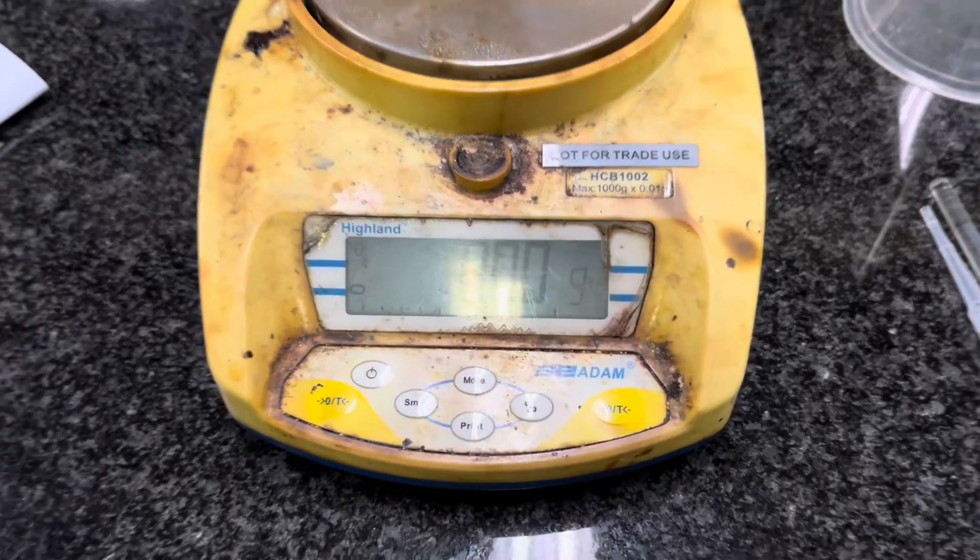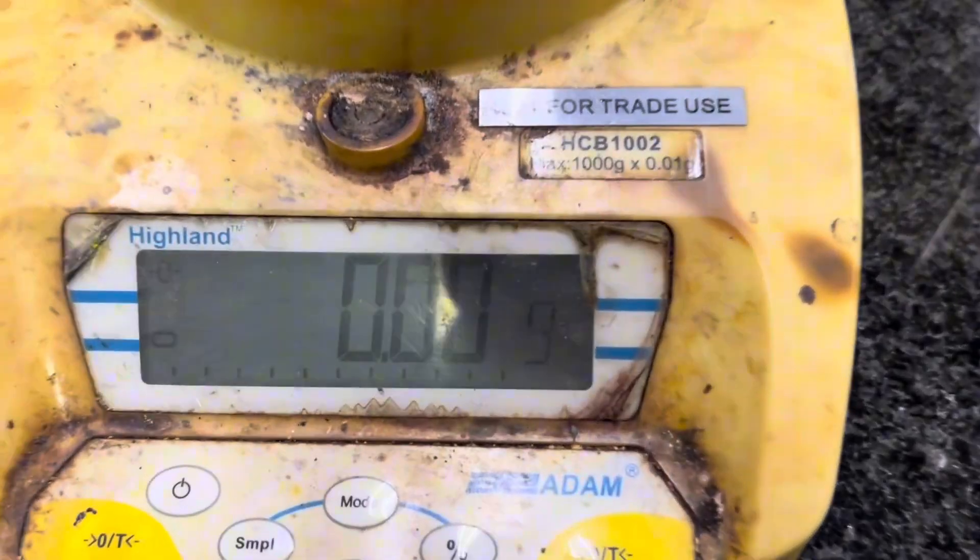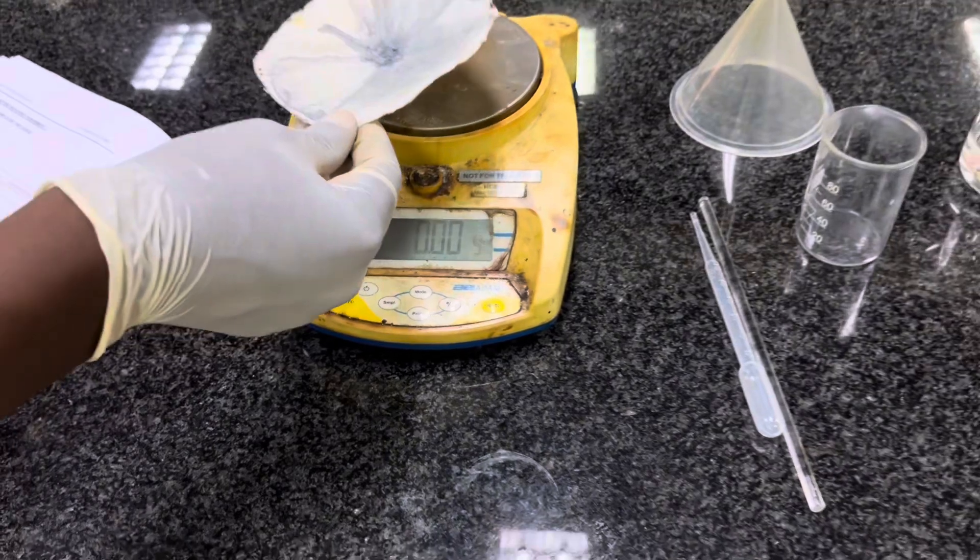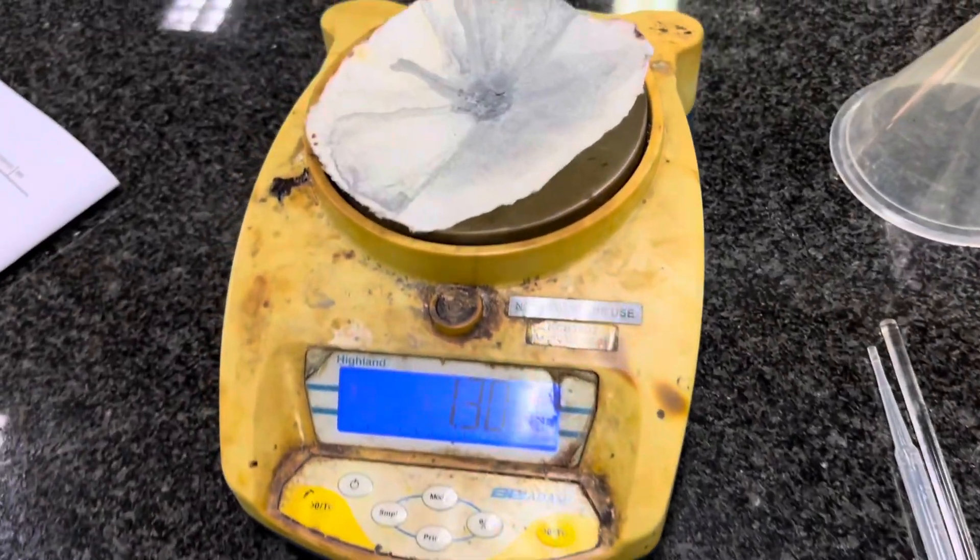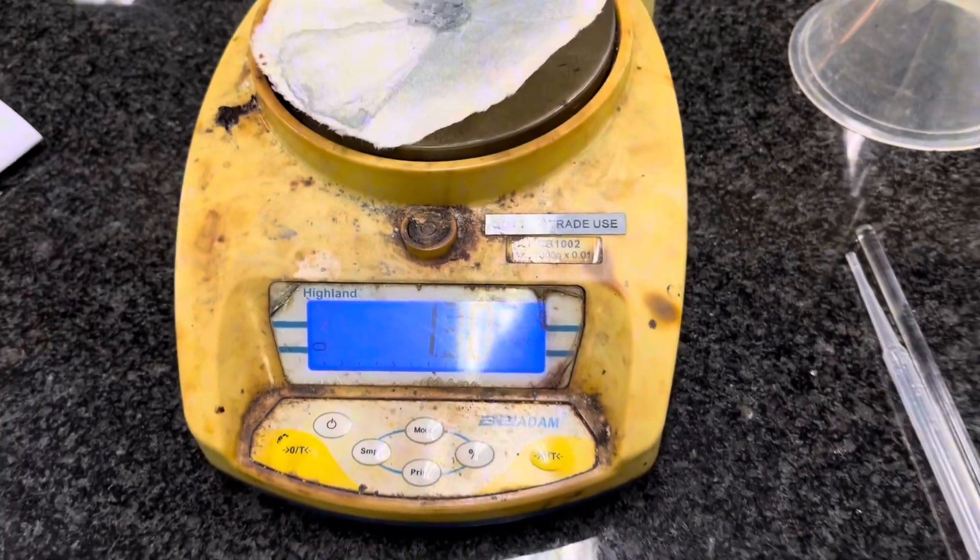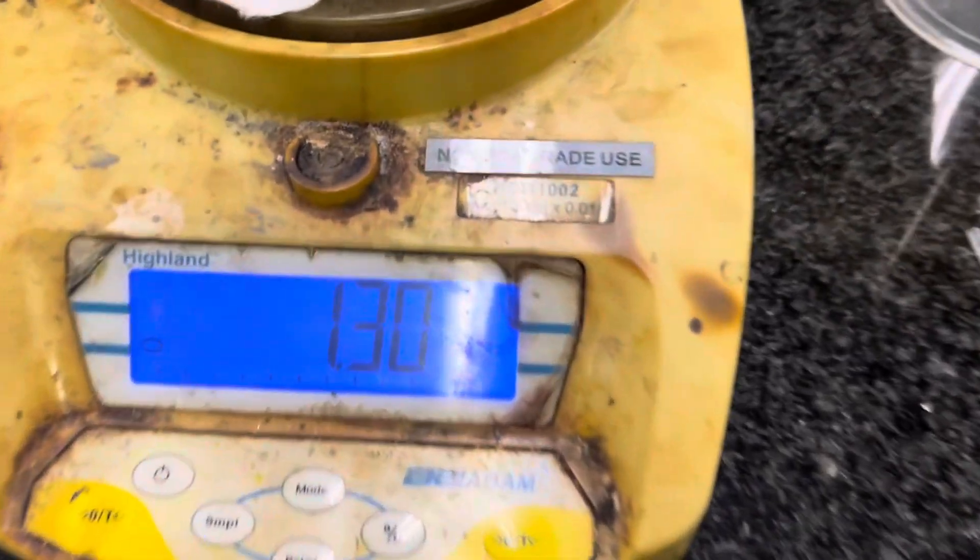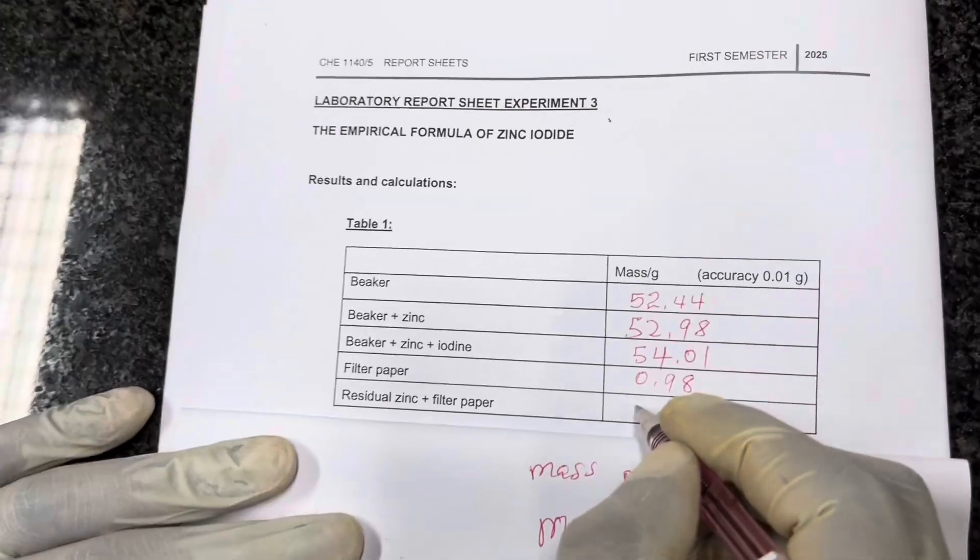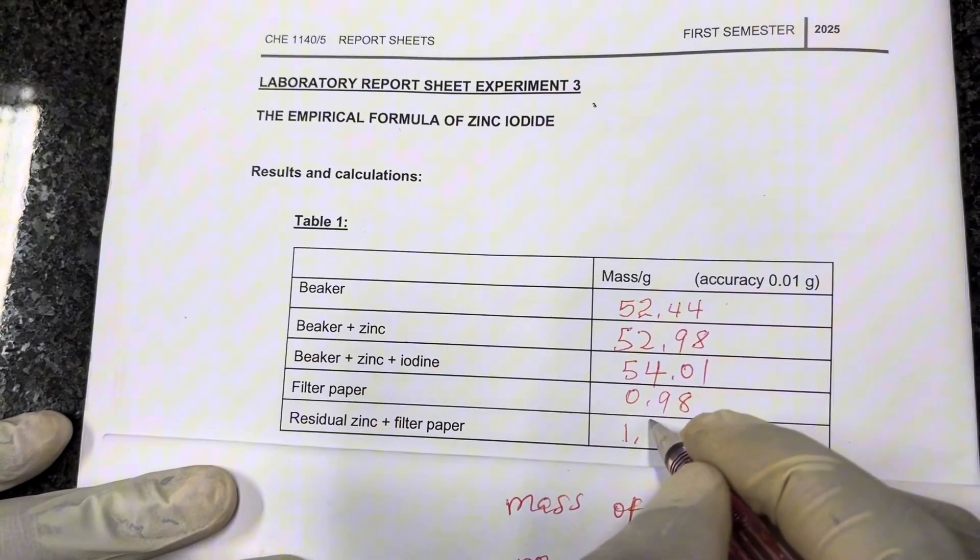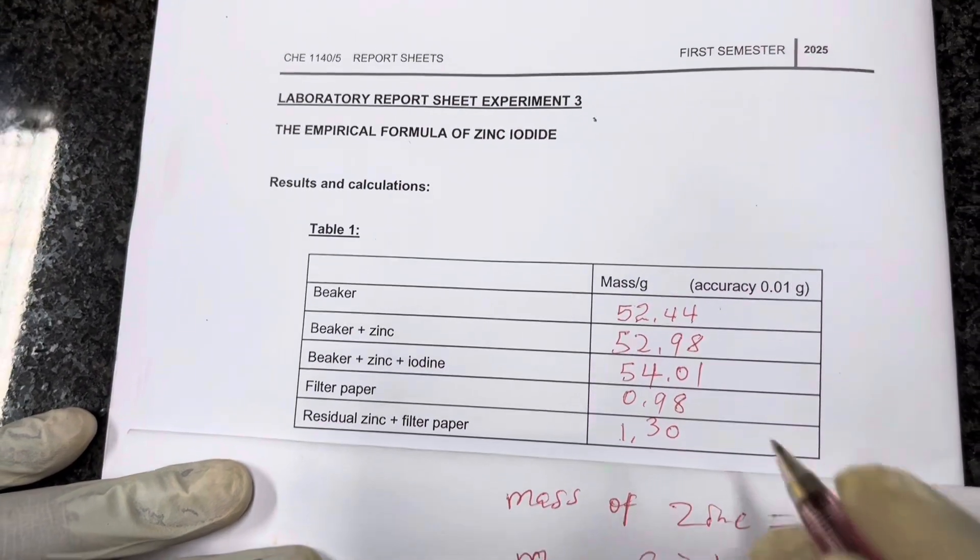So here it is. My weighing balance is at zero. I am about to weigh it. Now I weigh it. The mass was 1.30. That's what I got. 1.30. From there, I have to record it to say residual zinc plus filter paper. That's the mass. 1.30.